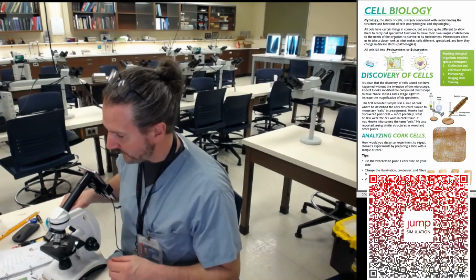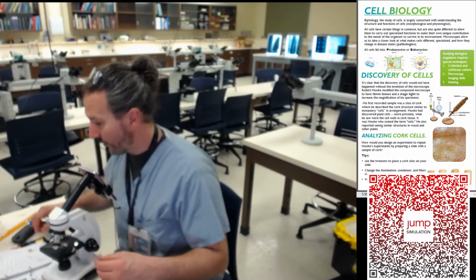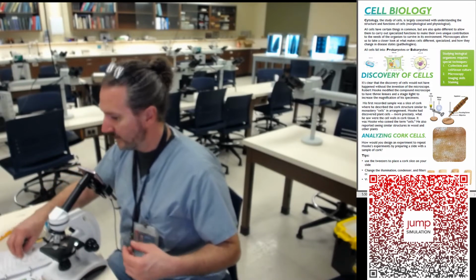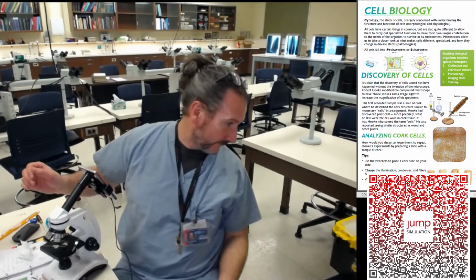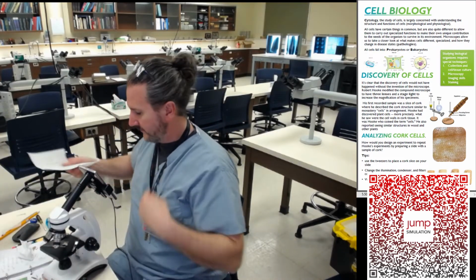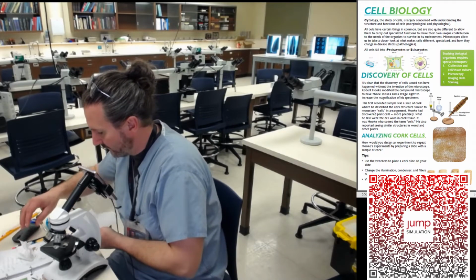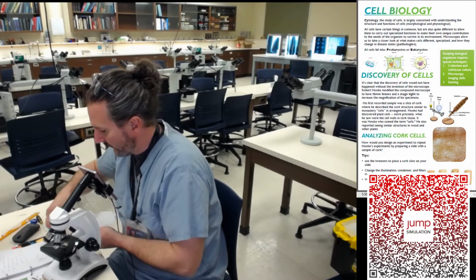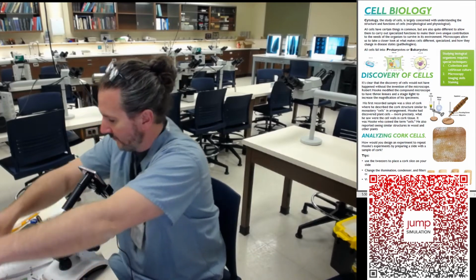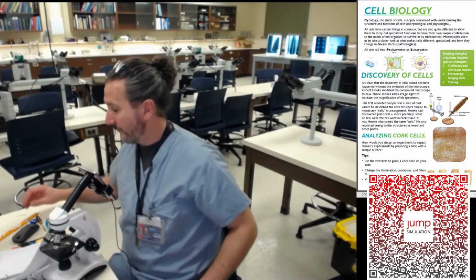Okay. So that was our looking at wood and cork cells. I'm going to brush these. Oops. I don't know where I put my garbage. So I'm just going to brush them off into this napkin, because I really don't want to have pieces of it all over the place later. There we go. I have my little trash pickup. And we can flip to the next slides.